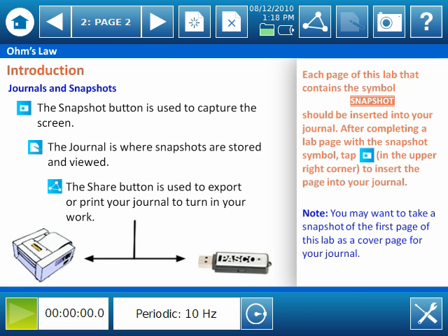The second page reminds your students how they will save their work and how that work can be turned in. Also, on the right-hand side of the second page are instructions asking students to use the snapshot button in the top right corner of the screen to insert pages into the journal wherever they see the snapshot icon. We'll see a demonstration of this in just a second. For now, let's go ahead and continue on.